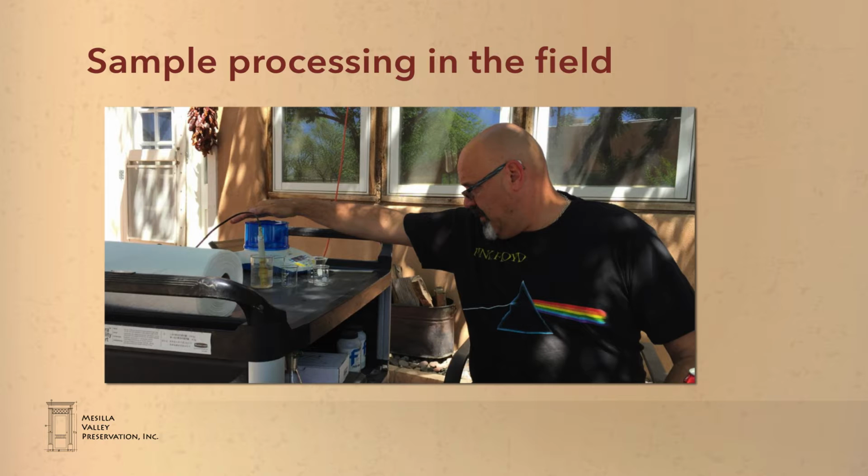Dr. Rockstraw is Department Head of Chemical Engineering at New Mexico State University in Las Cruces, New Mexico. Here Dr. Rockstraw is processing samples with our portable laboratory. Other than the tools mentioned, a laptop, tablet, or smartphone can be used to record and graph results.